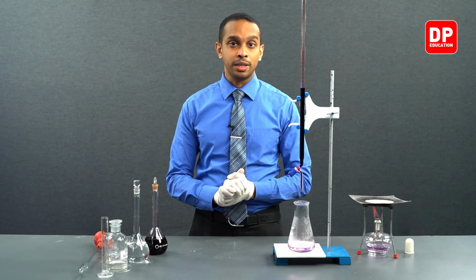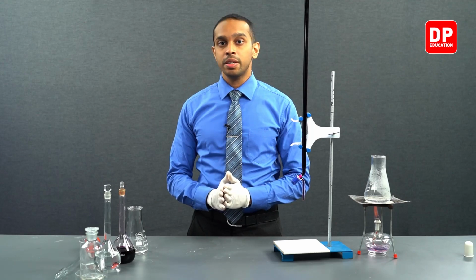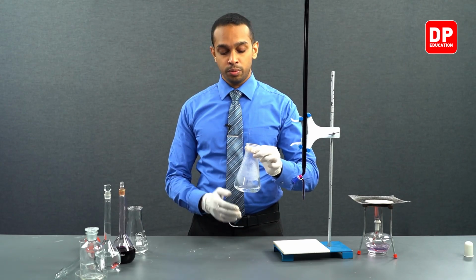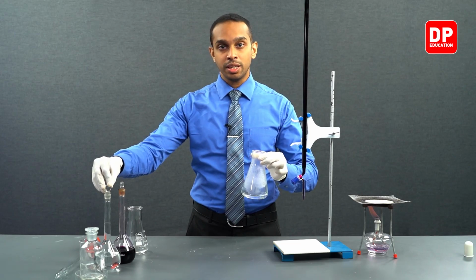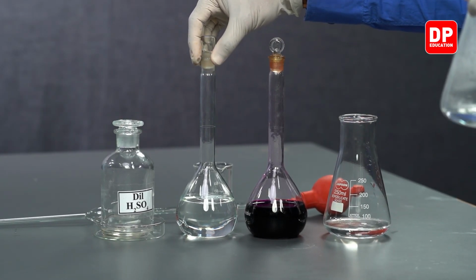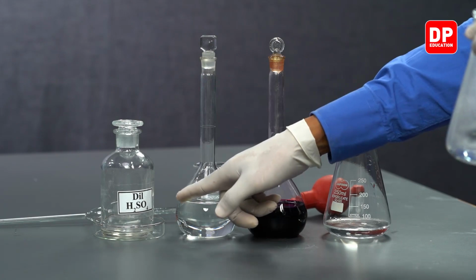Against potassium permanganate solution. Students, now we will be doing our second titration. Just like in the previous titration, we have prepared a solution in our titration flask. In order to make this solution, we took 25 cubic centimeters, measured with a pipette, of potassium oxalate solution, and then to that we added 15 cubic centimeters of dilute sulfuric acid.